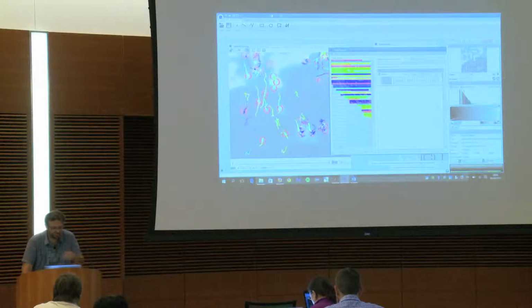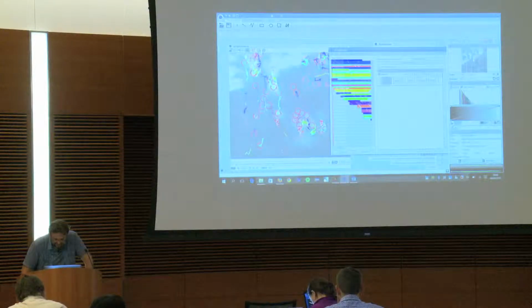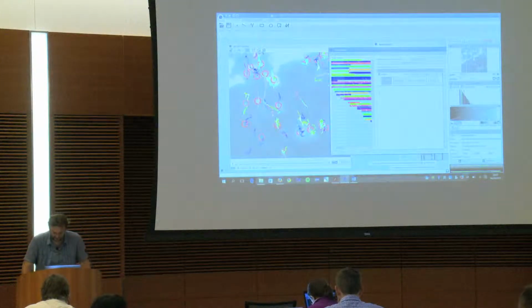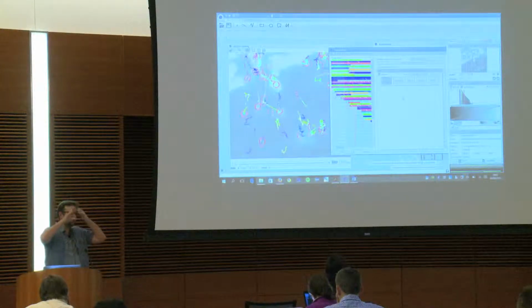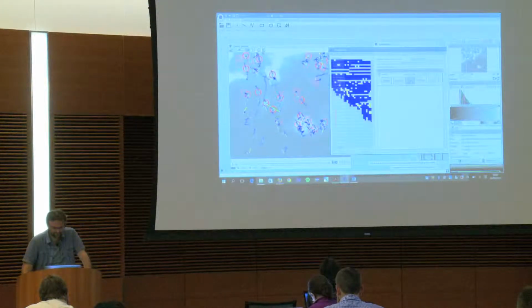And if you add a tracking that is able to deal with lineage, you would have things like that. So here I'm editing my tracks, but they could split like that, for instance. So you can edit it. And here you have another column where you can put other things, and those things are plugins too. Because let's say that you want to change a little something, like the color here. You don't like the color. Or you want to put this kind of color to see what is true and what is virtual in the image and what are the links.